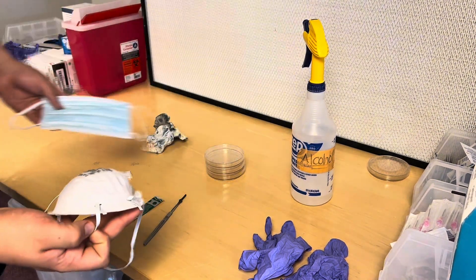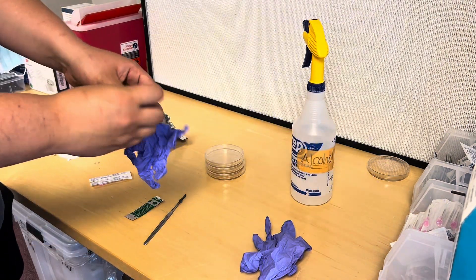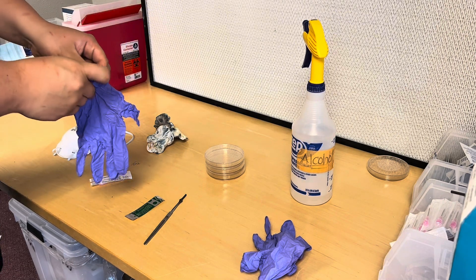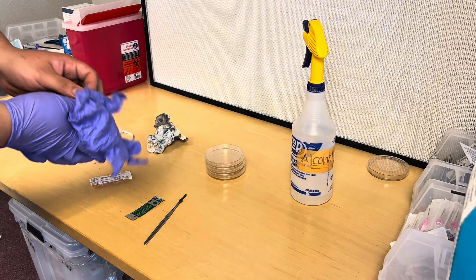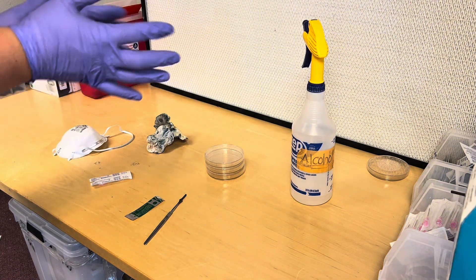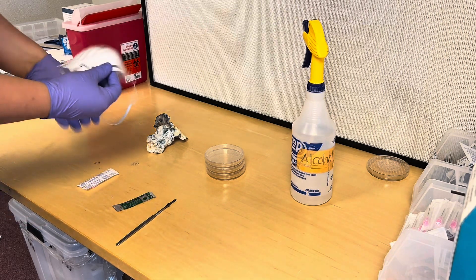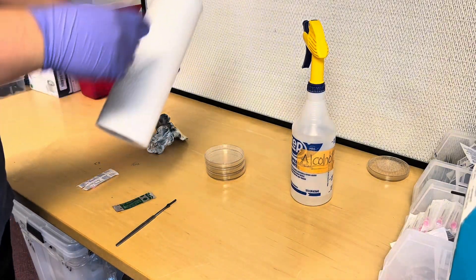You'll also need a mask. You can use an N95 or just one of those normal blue masks. I personally like N95 because it does a better job, but it really is just personal preference — both masks work. Even a bandana would probably work, just something to cover your mouth. Breathing can cause contamination on the agar plate, so it's better to be safe than sorry. Go ahead and throw that mask on.